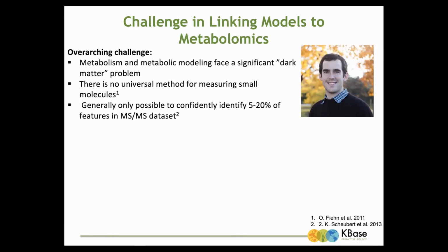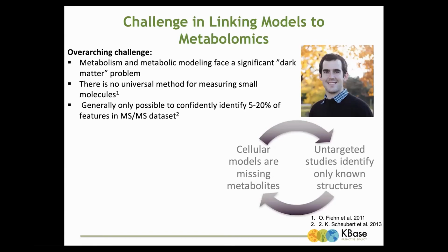So if the structure isn't in the database, you're going to have a hard time finding the compound using this technology. Or what they really do with MSMS is acquire a sample of the compound and run it side by side. That's called running a standard in metabolomics. And again, you can't get a standard for this complete dark matter molecule nobody's seen in a system before.